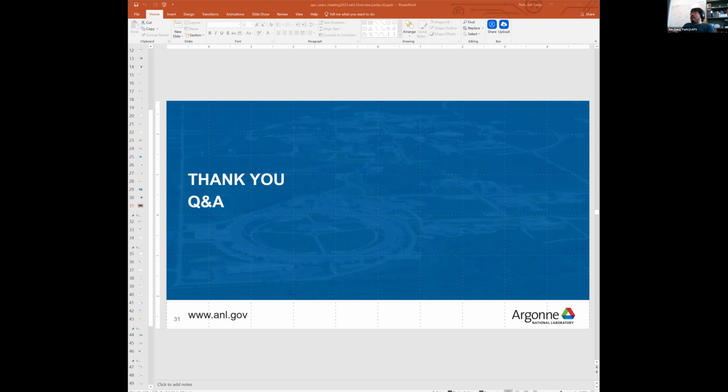And then for the general users to actually use these tools, it'll be optimistically 2025, but this is a very personal thing. It's not official. I'm not in a position to make any official statements. But as you know from our HEDM development, it took us some years to actually make it a user program. For example, the RAMS 3 combined with HEDM, so that'll be a good benchmark, I think.